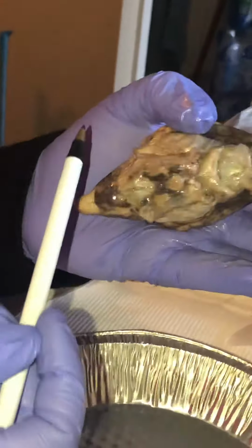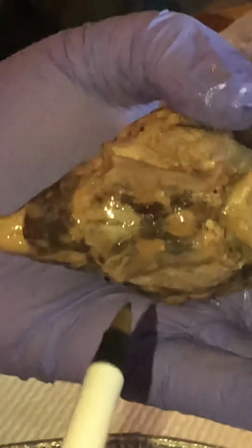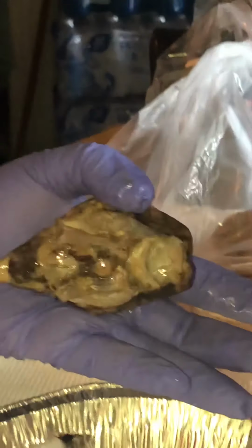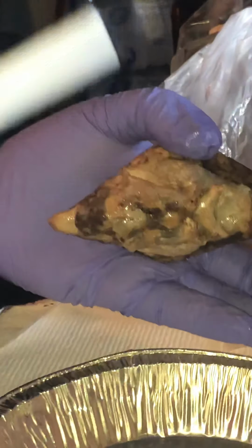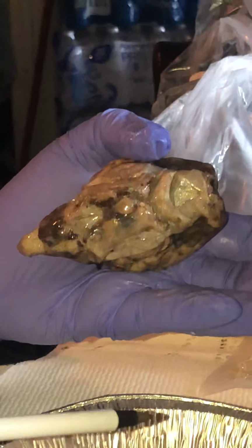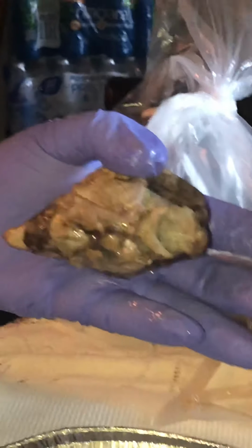Then we go up and we have the medulla. Well, the medulla is under the pons, so we have the medulla first. The medulla controls your basic body functions, like your breathing and your heart rate. And we talked about Mike, the headless chicken, who had the medulla and lived. We can't forget about Mike, okay? I'm not really familiar, but I'm going by what I know.